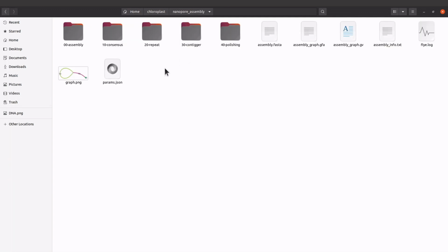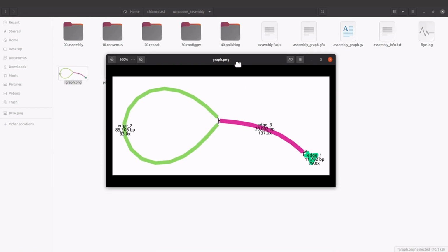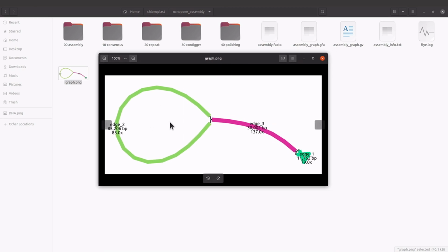So it's here. I'll open it. This is it. So you can open it. And let's say you are going to send a report, you can just input this image in your report. So you can have your Word document or spreadsheet or whatever, and then you just add this image to it.